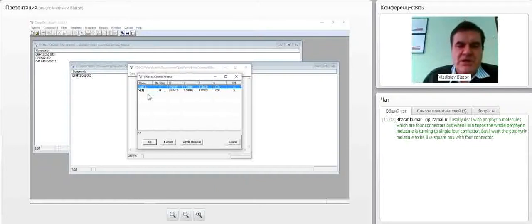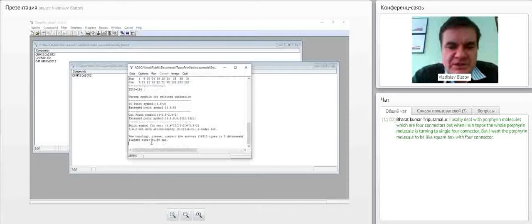Okay. And we see that we have here a new topology. According to this version of the TTD collection, this topology is new. Strictly speaking, to get the whole information, you have to use the whole TTD collection, but this TTD collection is not free of charge. You have to pay for the collection. This is one way.